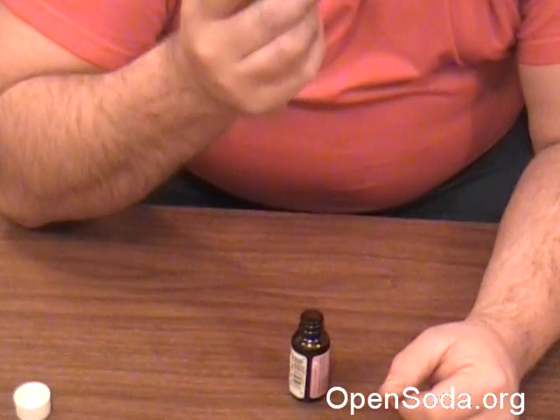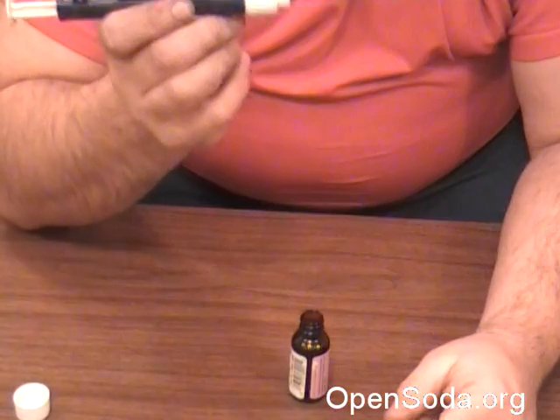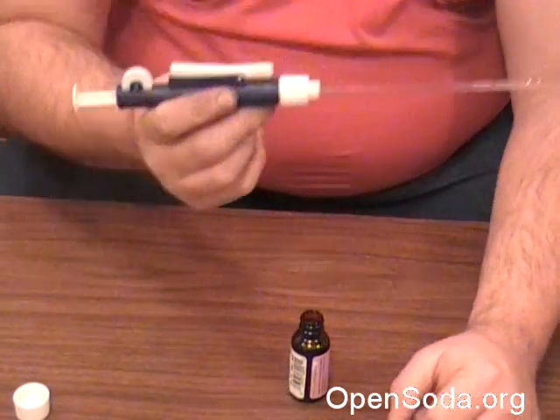If you're doing lots of open cola and you have a pipette and you're using these oils, get the pipette pump. Oh my God, is it worth it. There you go.